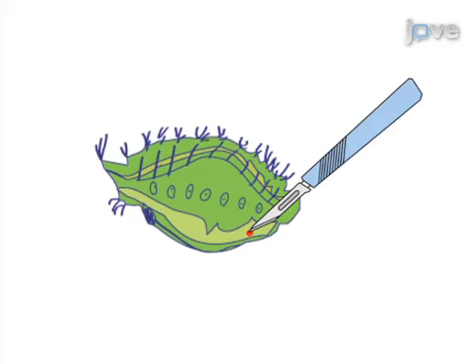The second step is to make a shallow incision at the posterior end of the caterpillar using a clean scalpel.